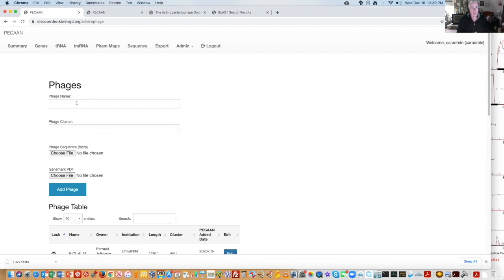But you really can put in any name you want. I put in practice, for example; you can put in any name you want. So for the Lux, I could simply put in, say, practice 9, and we could just say this practice.